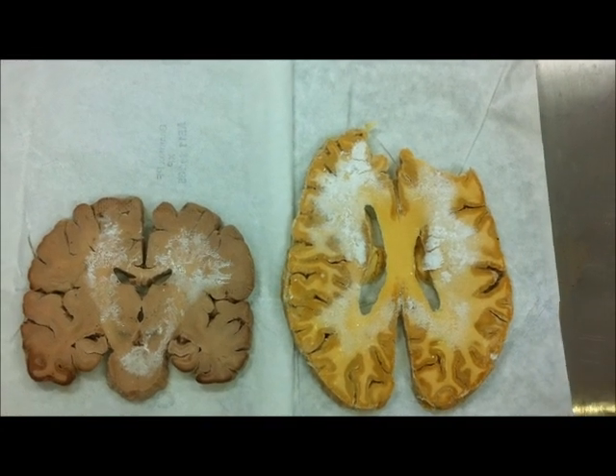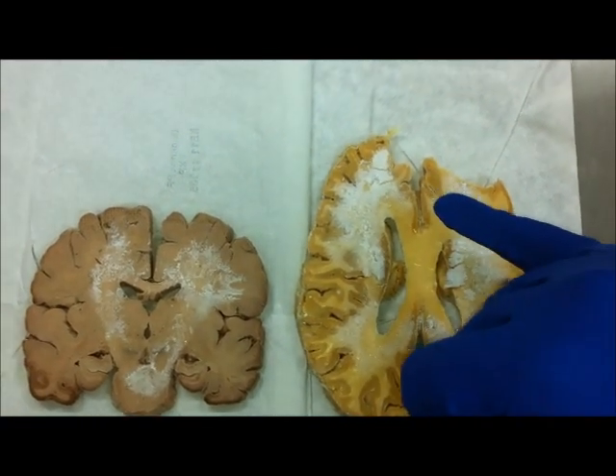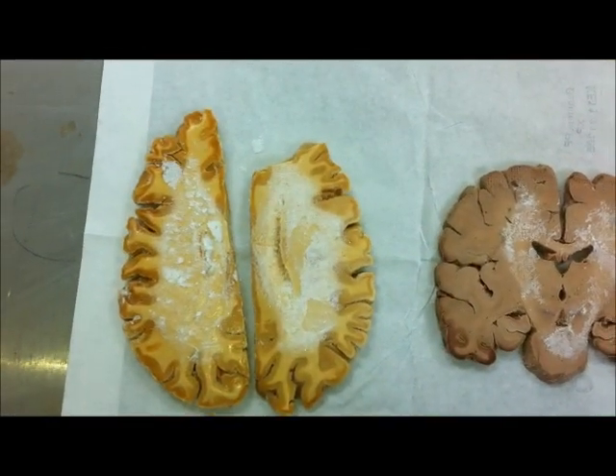The feathered crystallizations are seen widely around the white matter of the brain, as we can see here. Different brains have different levels of crystallization.